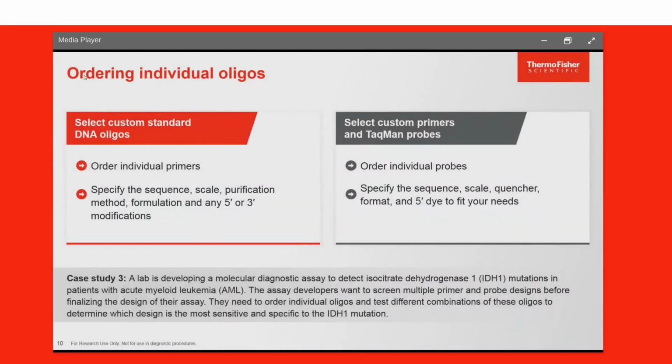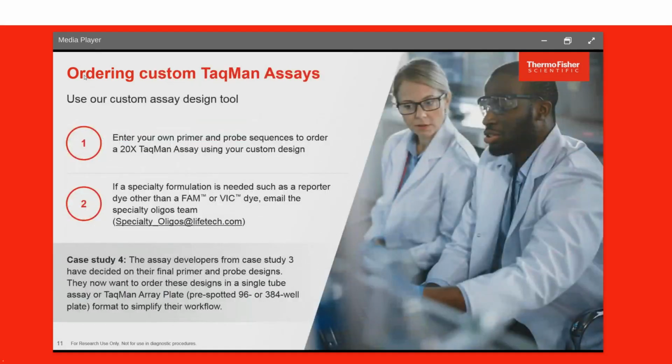And so case study 3 has been pretty well addressed. This molecular diagnostic lab will be able to order the individual primers and individual probes they want to be able to screen different assay designs for moving forward on this IDH1 project. So now let's jump to case study 4. So now let's say that same lab has solidified their assay designs. They know which primers and probe perform the best, and they know exactly what they want the primer and probe sequences to be moving forward.